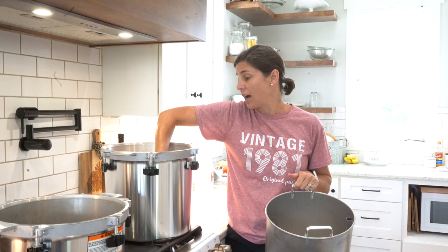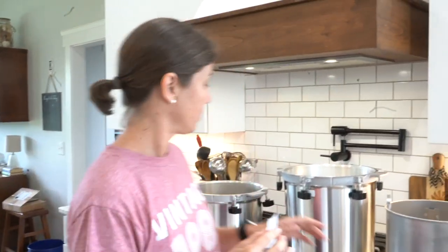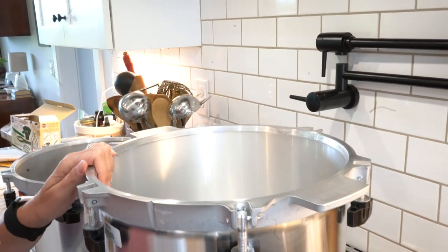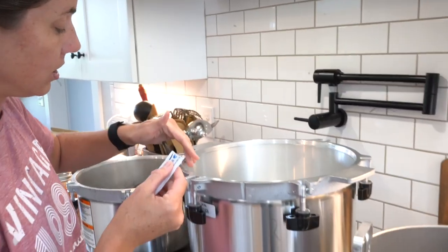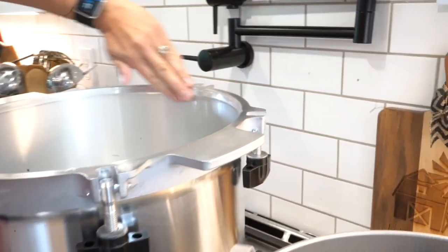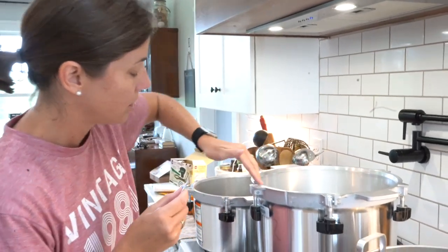You could get iron buildup and minerals from the water. Just like with the pressure canner, the All American does not have rubber seals that you have to worry about, but you do have to make sure that you lubricate the top edge. I use olive oil on my pressure canner, but for the sterilizer they recommend a vacuum grease or petroleum jelly. Apply it while it's cool so it doesn't slide everywhere. Lubricating all around keeps your steam from escaping, so you don't have to worry about rubber seals wearing out.